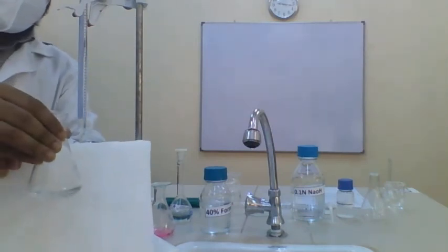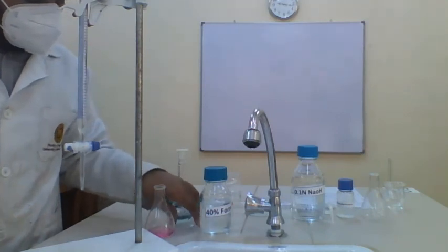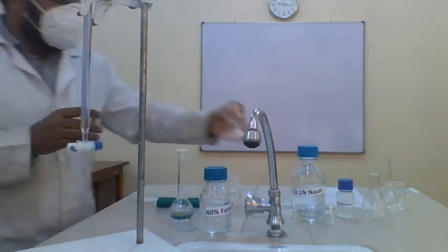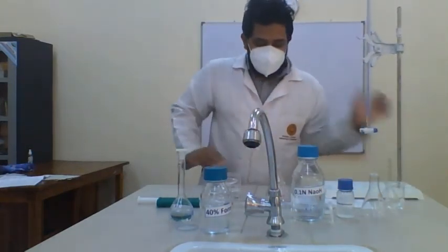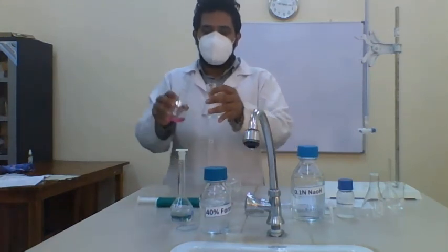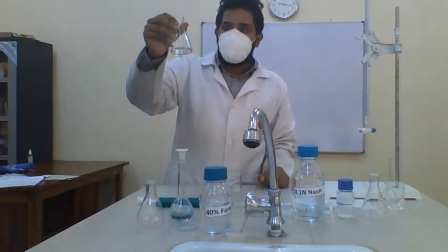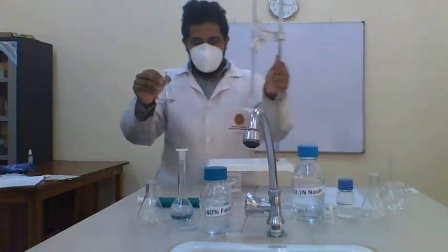You can see here we have the neutralized formaldehyde solution with me and the neutralized amino acid solution. Then, as the next step of this titration, we have to mix the neutralized amino acid with the neutralized formaldehyde solution. Then we have a combination of amino acid and formaldehyde.